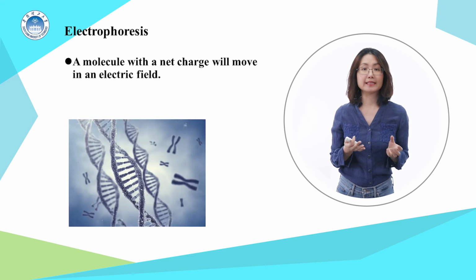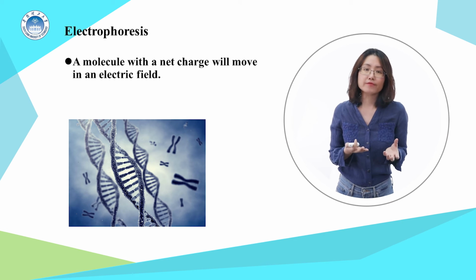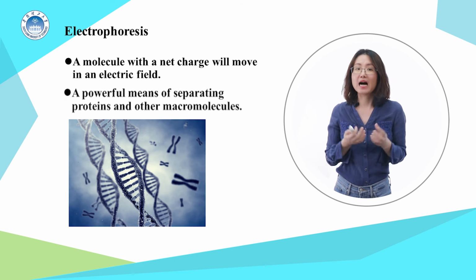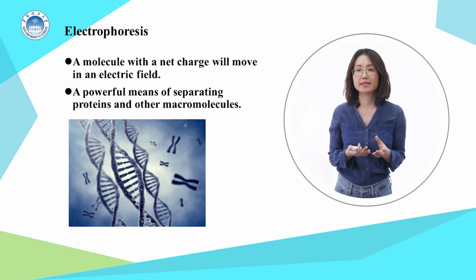A molecule with a net charge will move in an electric field. This phenomenon, termed electrophoresis, offers a powerful means of separating proteins and other macromolecules.